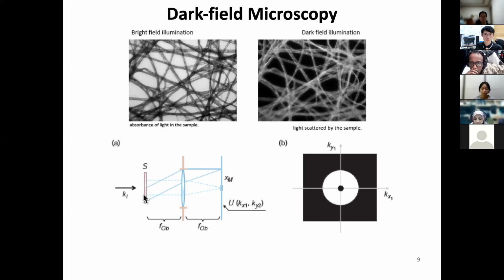And there's a focal plane over here. When you shine the direct light through this lens, this collimated light will focus down at this point. And that part we call the Fourier plane. So one F and the other F, and these are conjugate as a Fourier plane, and we'll get back to this again. But remember, this plane wave will all focus down at the middle here.